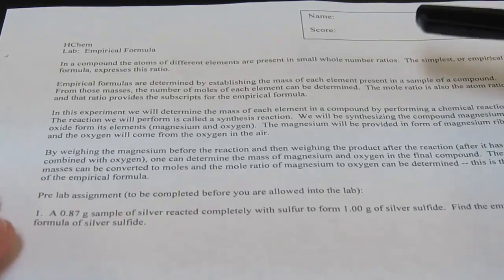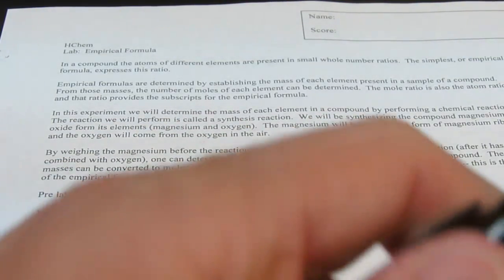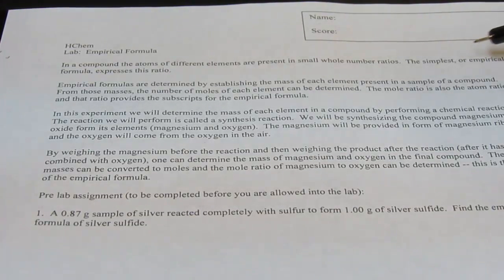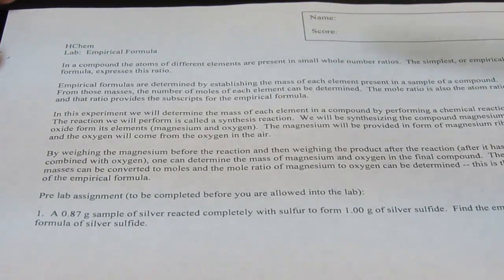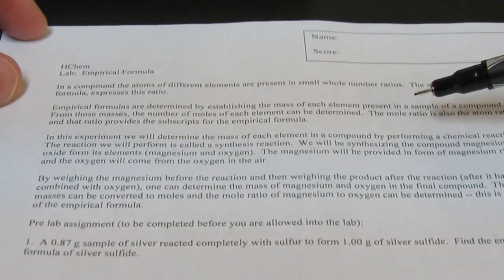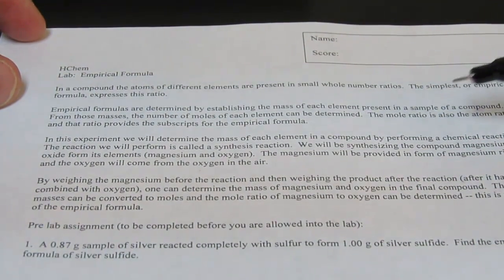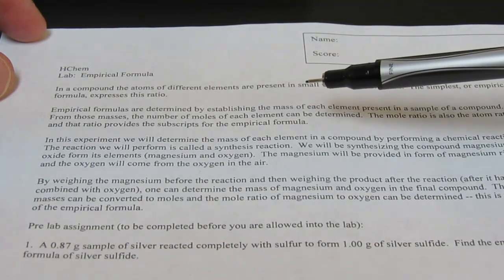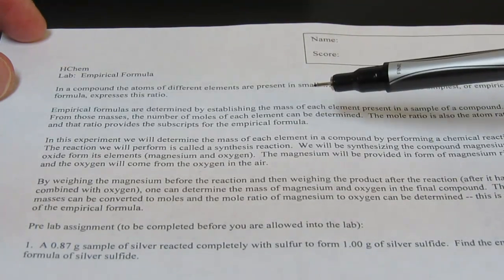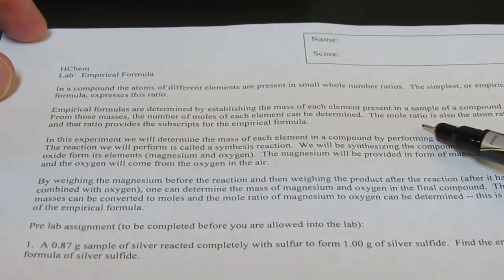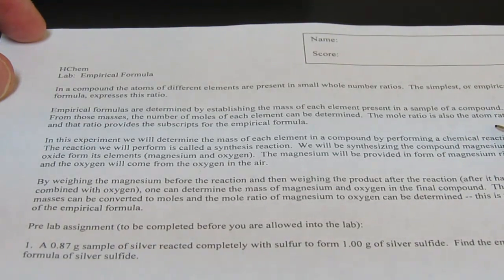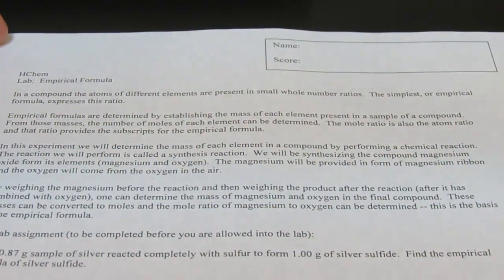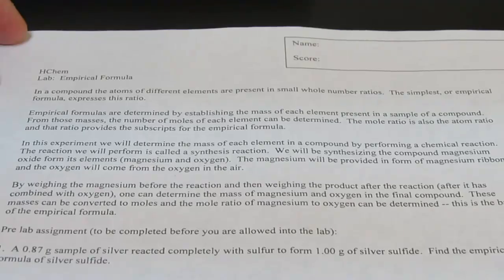In a compound, the atoms of different elements are present in small whole number ratios. The simplest or empirical formula expresses that ratio. Empirical formulas are determined by establishing the mass of each element present in a sample of a compound. From those masses, the number of moles of each element can be determined. The mole ratio is also the atom ratio, and that ratio provides the subscripts for what we call the empirical formula.